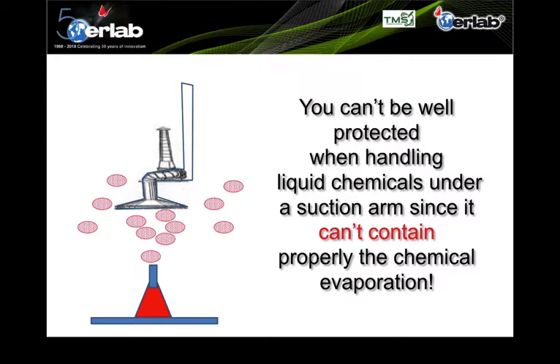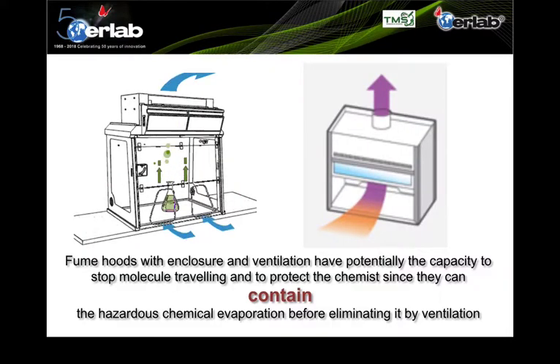You can't be well protected when handling liquid chemicals under a suction arm, since it can't properly contain the chemical evaporations. Therefore, fume hoods with enclosure and ventilation have the potential capability to stop molecules from traveling and to protect the chemist, since they can contain the hazardous chemical evaporation before eliminating it by the ventilation system.